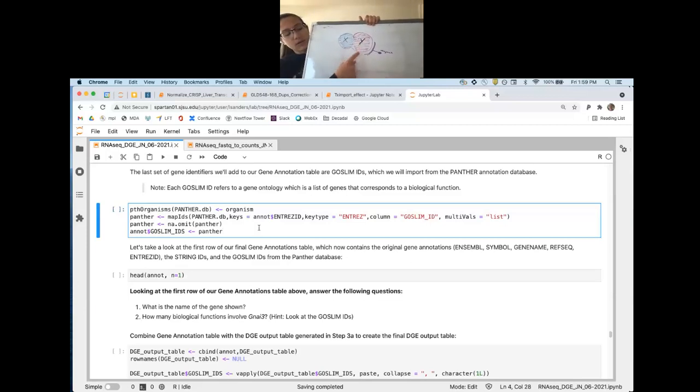Since we know what protein Y is, we can create an antibody that's going to target or latch on to protein Y. And of course, we have to make sure that it's unique to protein Y, so we don't want it latching on to anything else, or else we'll get off-target effects. And what we learned from the library prep, when we used this antibody technique to pull down ribosomal RNA, is that in addition to this antibody being specific to protein Y, we can also biotinylate it so that way it's going to be magnetic.